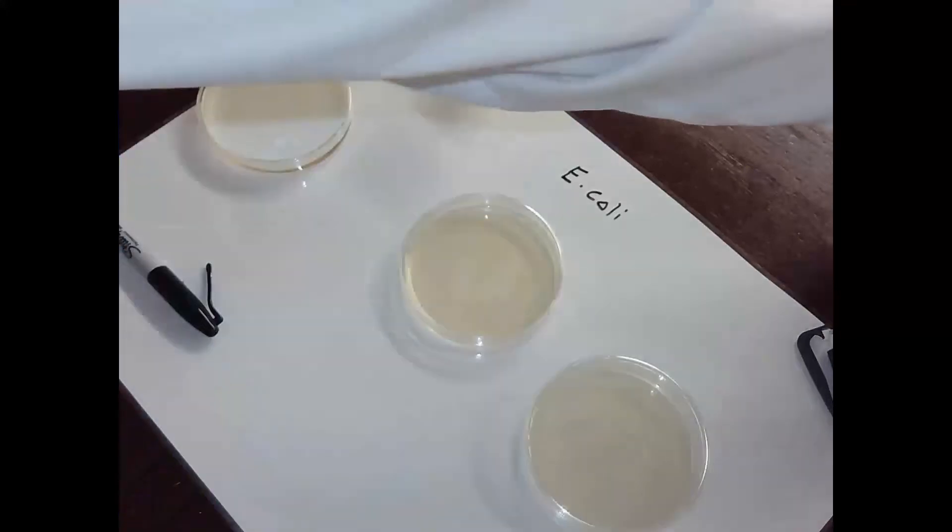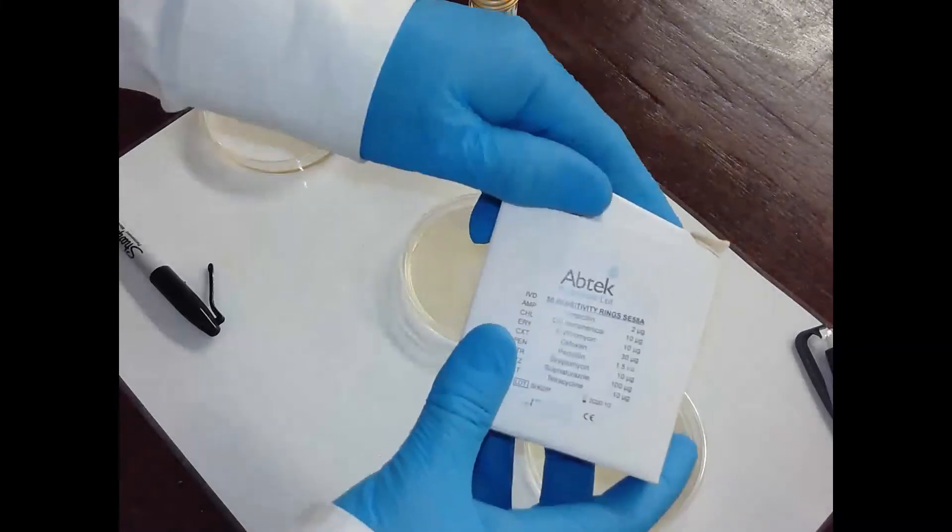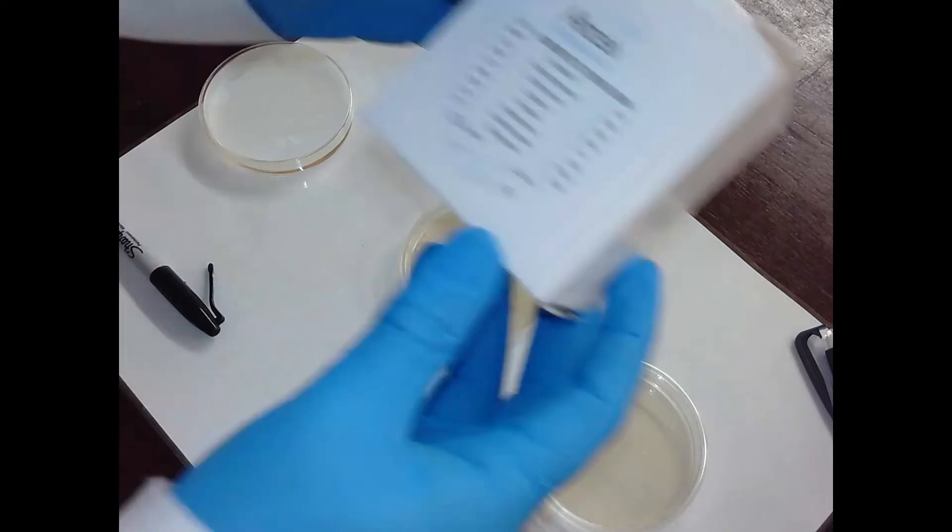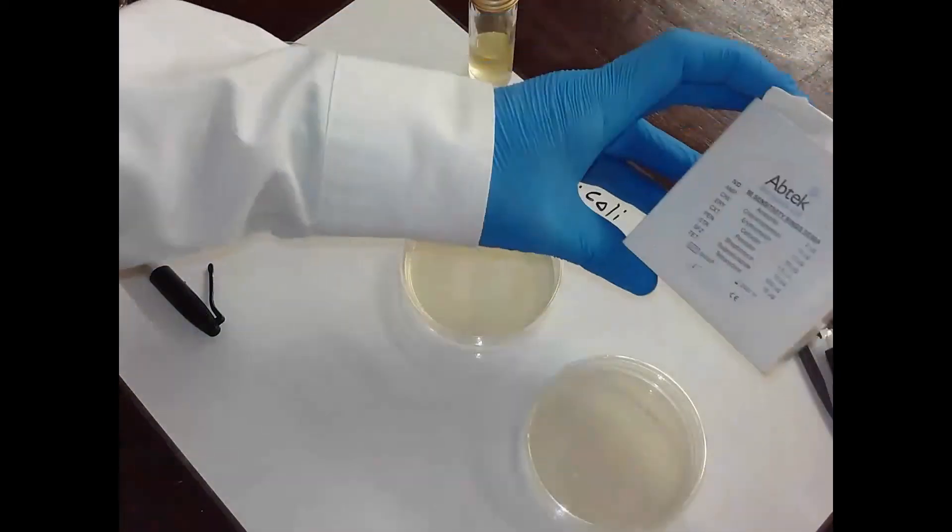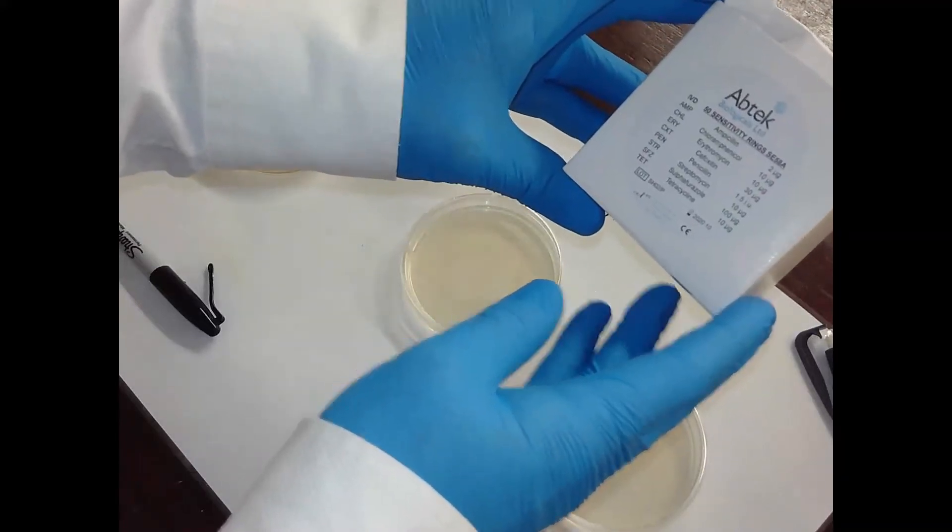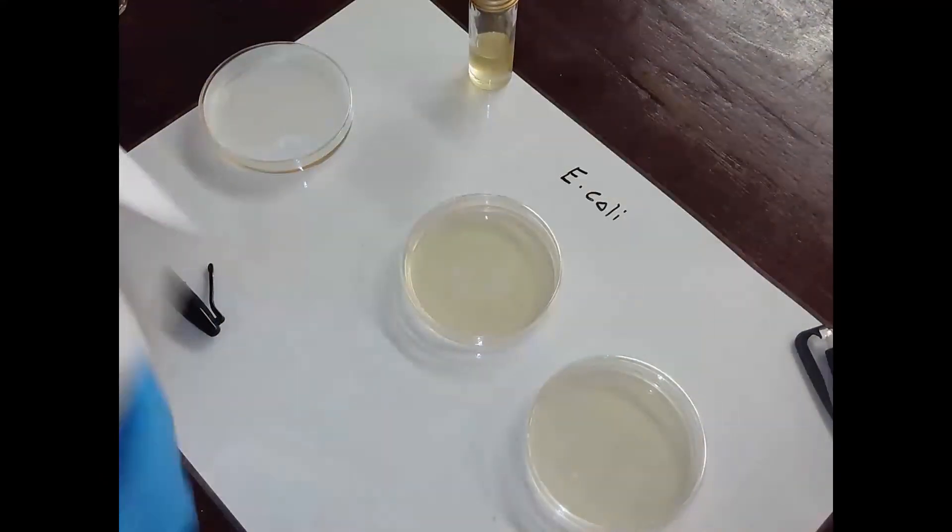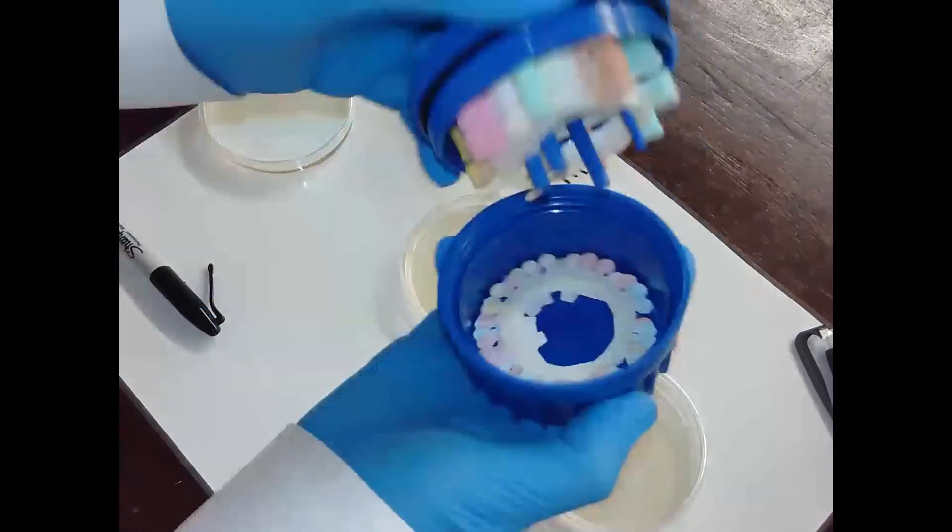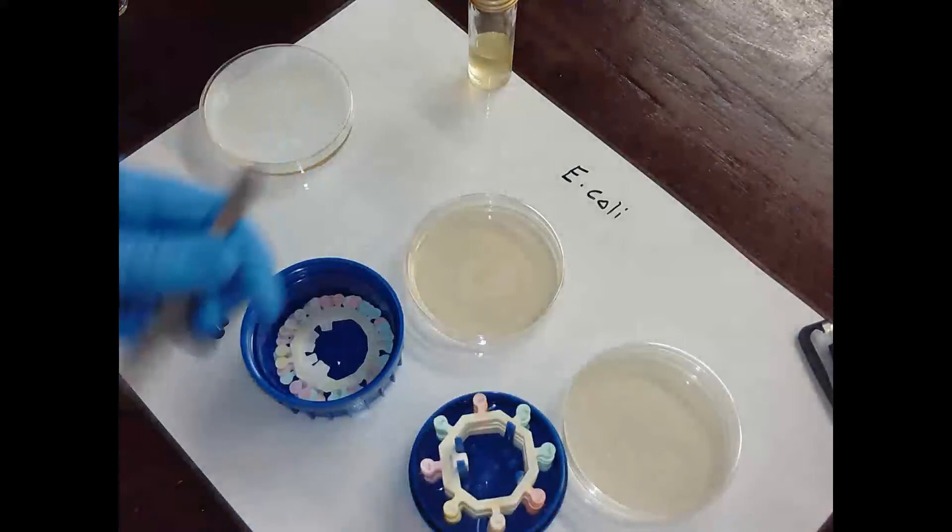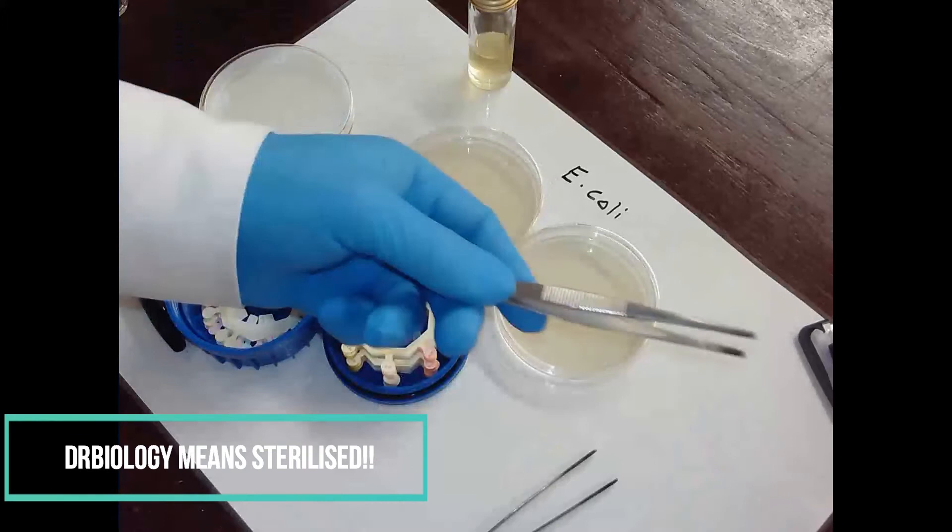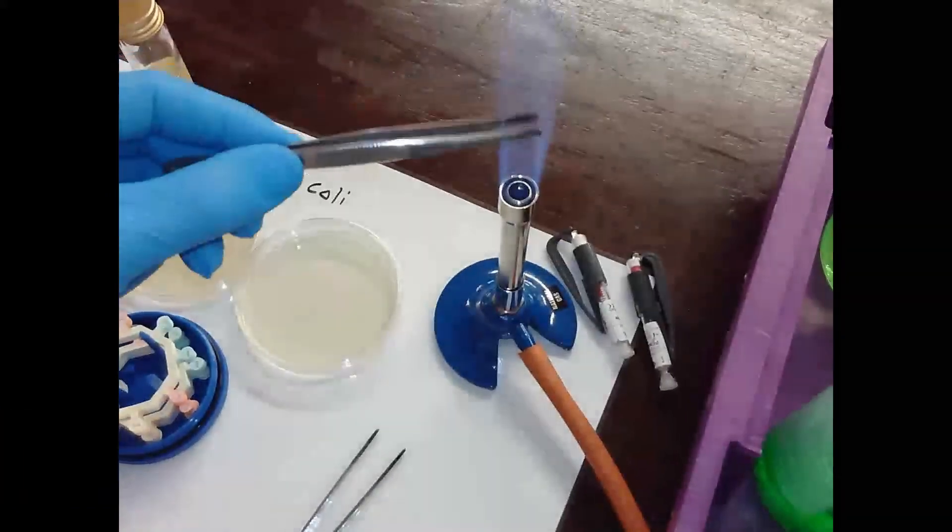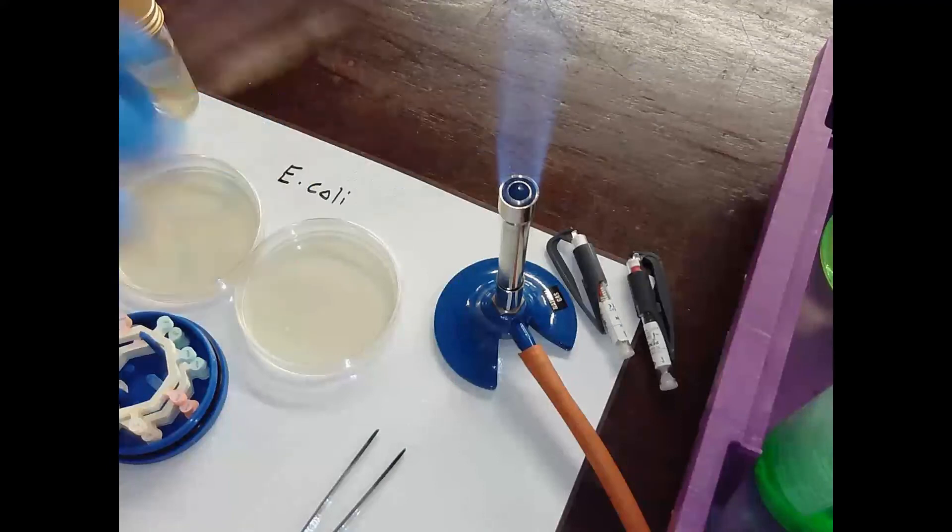We're going to test some antibiotics. I've got some A-level stuff that we're going to use today because I thought it'd be more interesting. We're going to be looking at sensitivity rings. We're going to test ampicillin, erythromycin, penicillin, streptomycin, tetracycline - quite a lot of different antibiotics today. The antibiotic ring comes in a package like this. I need to get a set of tweezers.